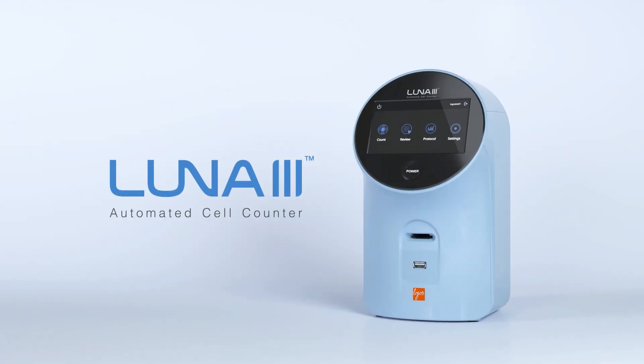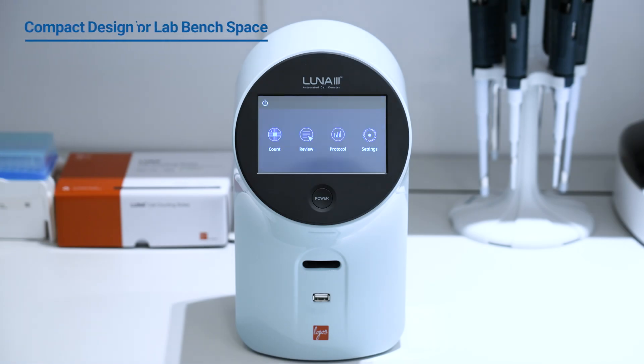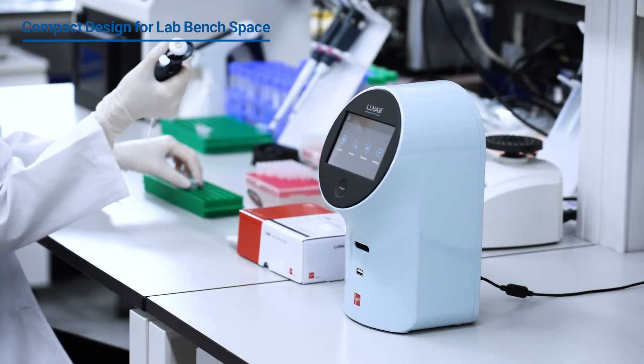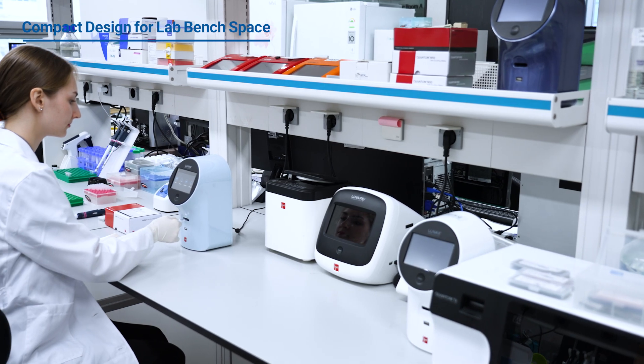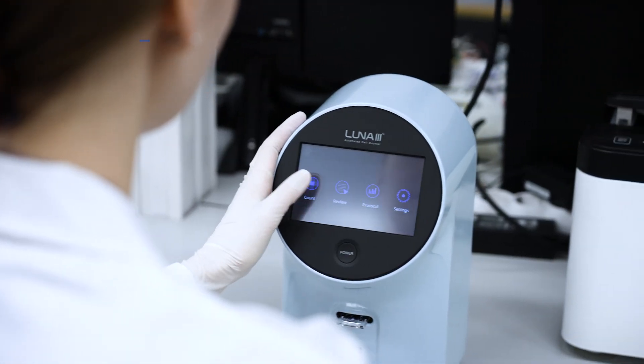Introducing the Luna 3 Automated Cell Counter. Save valuable bench space with our compact design. At only 16 cm wide, the Luna 3 fits easily into any lab setup, making efficient use of space and resources.